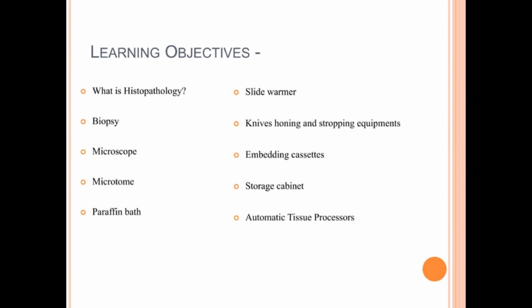The tools used in histopathology labs are like the essential instruments in a detective's kit, helping us uncover the mysteries of tissue samples with precision and accuracy. These tools play a vital role in preparing, processing, and analyzing tissues effectively. Here are the key equipment and concepts that will be covered.